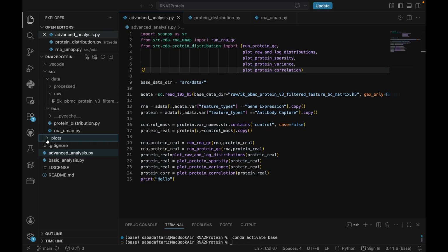In our case, our RNA matrix is sparse, right? Lots of zeros, and it's large. It's 4,000 by 2,000. And you only want, let's say, the top 50 components. It takes this complex, high-dimensional data and simplifies it into a 2D or 3D visual map. So with visualization, it will group similar data points into clusters and separate the dissimilar ones.